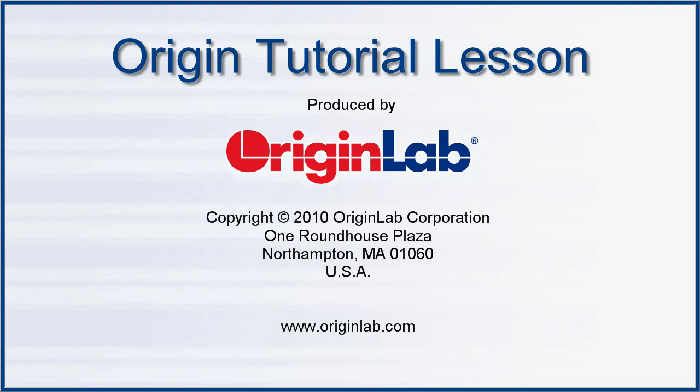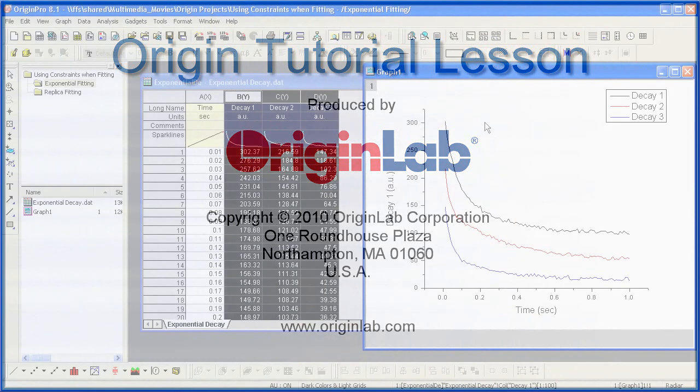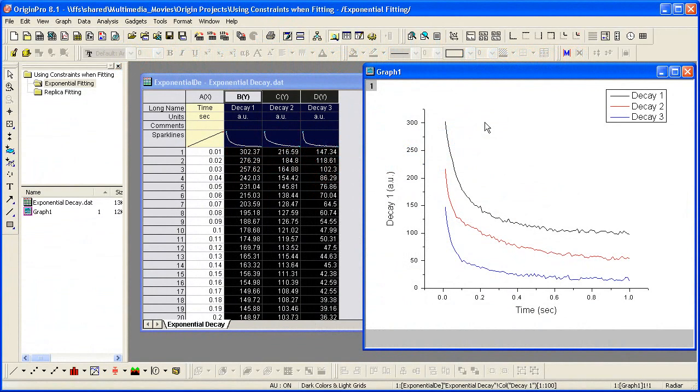In this movie I will show you how to enable constraints when fitting. You will learn the syntax for writing constraints for groups of parameters.